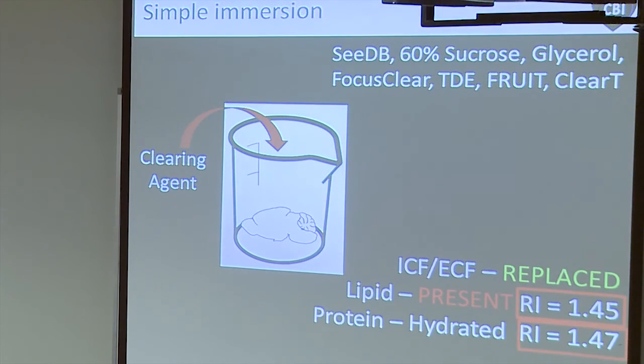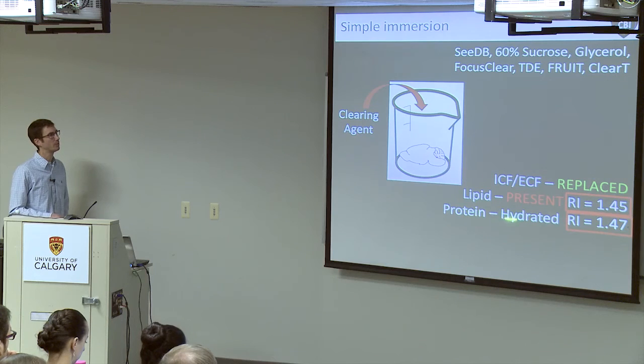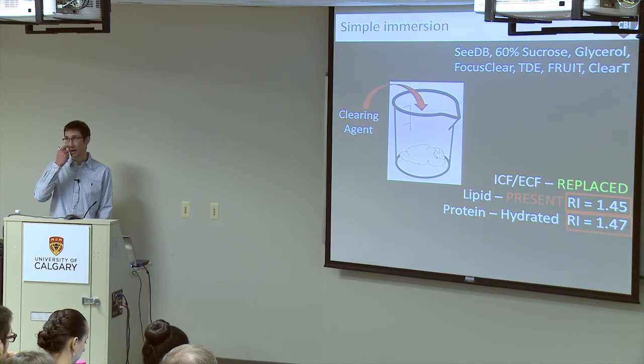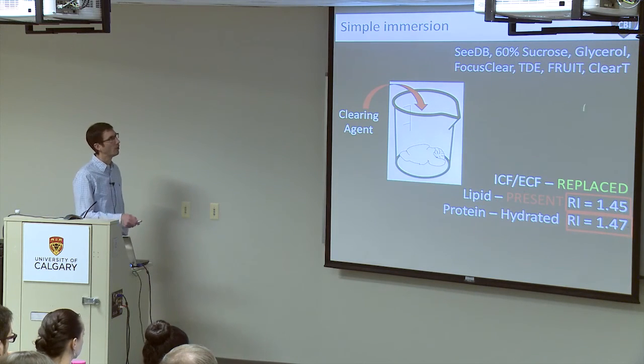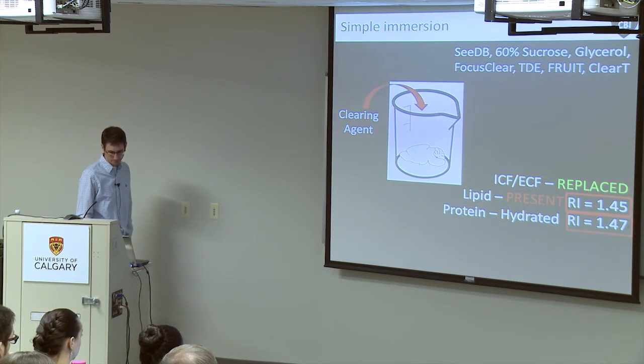Essentially all you're doing here is just replacing this intracellular and extracellular fluid and trying to match as best you can everything else that's been left behind. Okay? So all of these clearing solutions have a refractive index somewhere in this range.